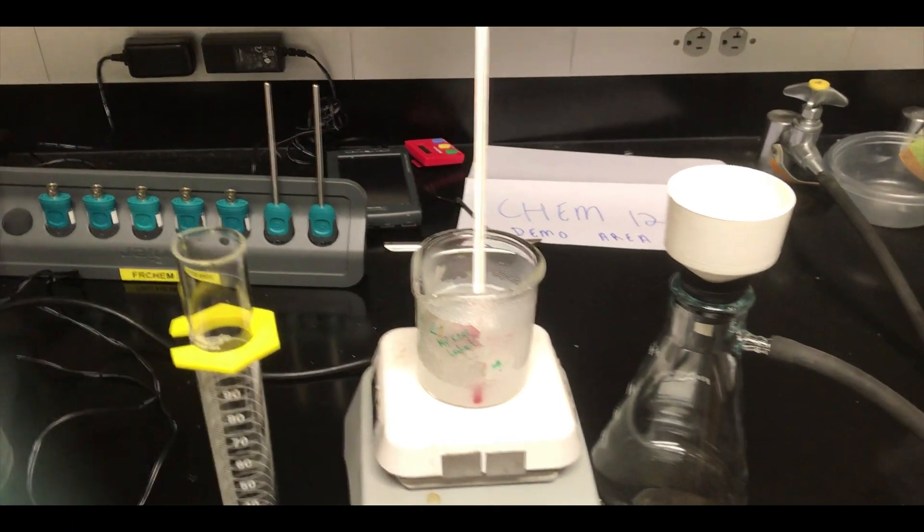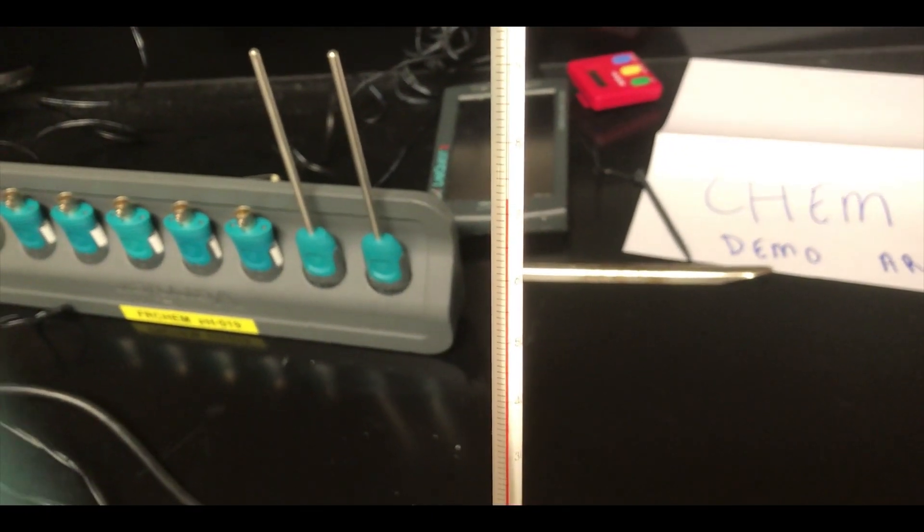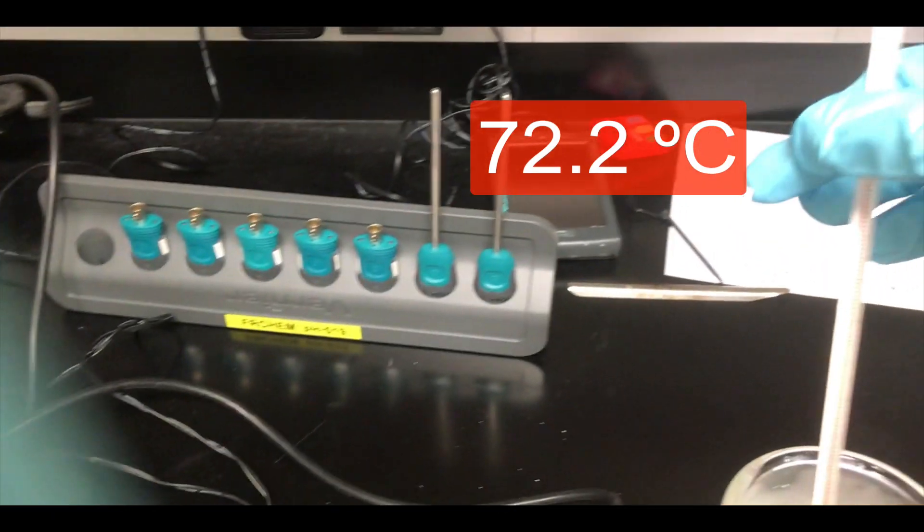So we're starting here with a saturated solution of magnesium hydroxide, Mg(OH)2, at high temperature. This is at about 72.2 degrees Celsius.